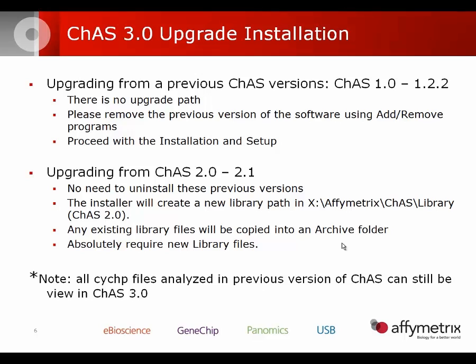If you are running CHAS 2.0, the installer will create a new library path on whichever drive you're installed on, for example C:\Affymetrix\Chas\Library. Any existing library files will be copied into an archive subfolder within that path. In CHAS 3.0, it is absolutely required to have new library files due to the new APT2 framework. All chip files that were previously analyzed can still be viewed in CHAS.